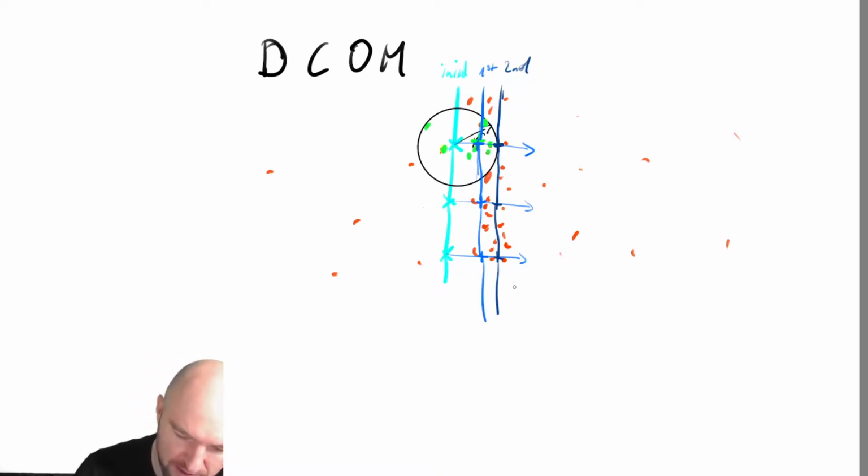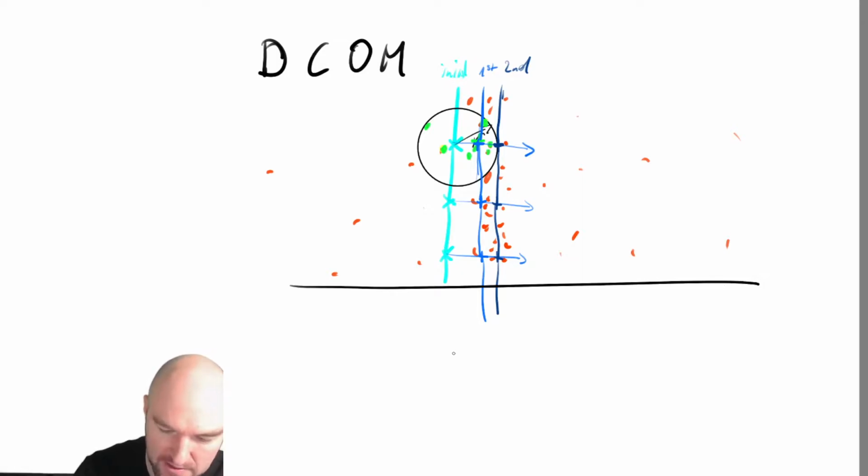This thing obviously has one downside, and that is at some point your data is just going to end. So you're going to have your data set hull. The data is going to end somewhere here. So for all of the vertices very close to the end, they're always going to be slightly pulled inwards, because obviously there is no atoms outside. So we might need to deal with that one afterwards. So we might need to adjust something there. But the better my initial guess is.